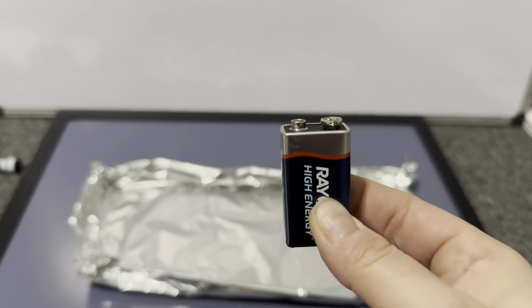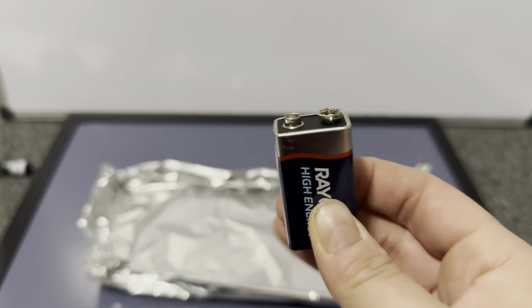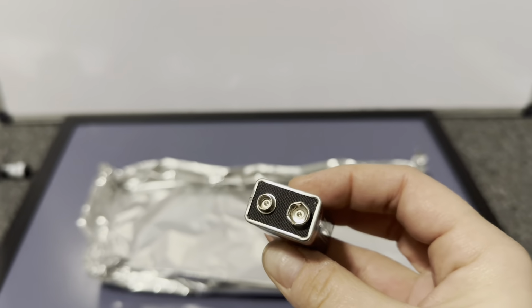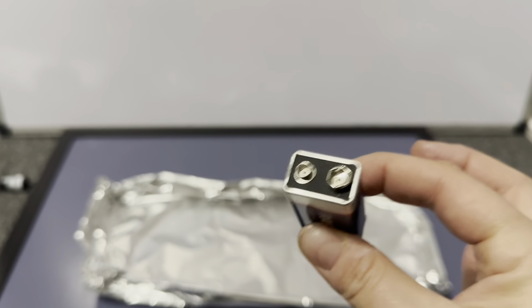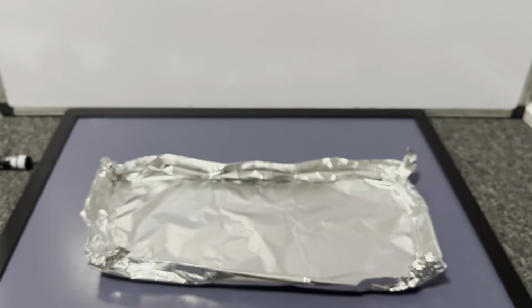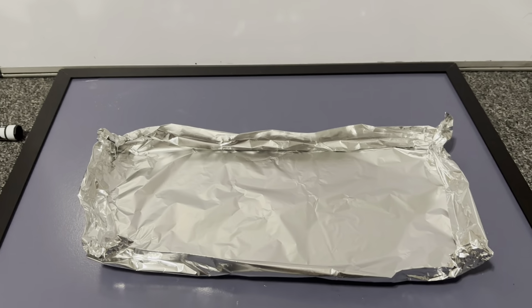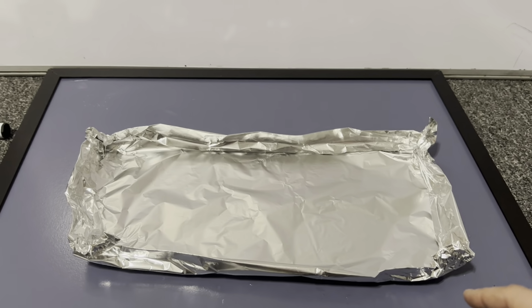Now, it's very important that you keep these things separate from each other. This reaction is, once it gets going, it's almost impossible to stop, and it is going to spark up. So you don't want to start the reaction until it's safe for you to do so. So we're going to need to let our fire happen inside our aluminum foil boat. Your instructions ask you to weigh this before.